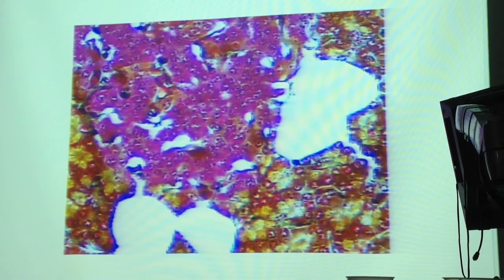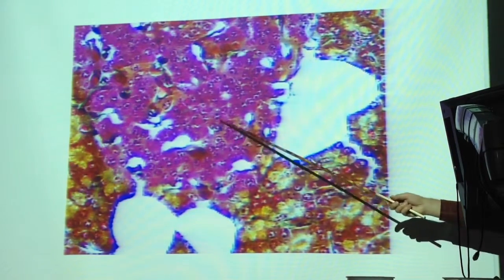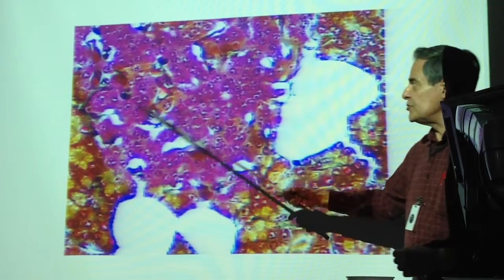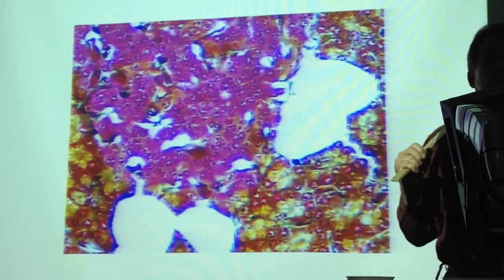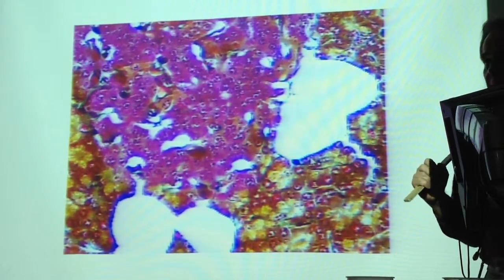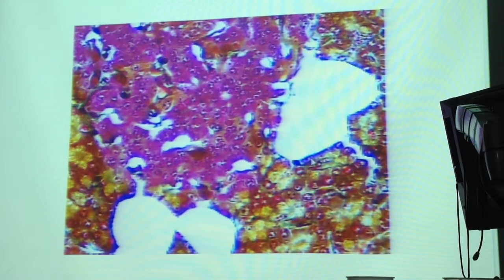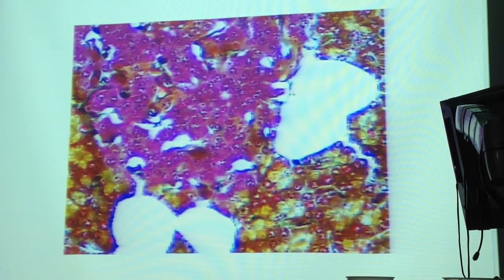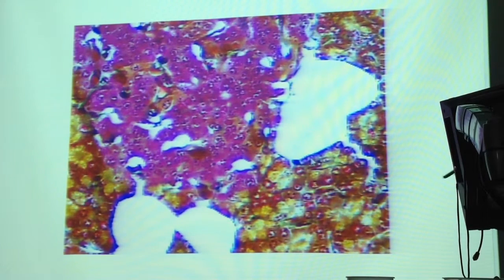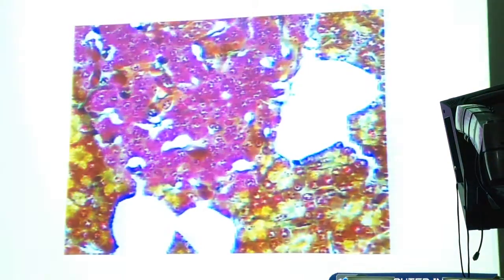The major cell type in the pancreatic islets stain kind of a rose pink, which you see here, and they're the most abundant. These are beta cells. And beta cells, you may remember, produce insulin. What does insulin do? Lowers glucose levels in the blood. Stimulates cells to take up glucose and stockpile it in the cell as glycogen. So it's lowering blood glucose levels. That's the major cell type.